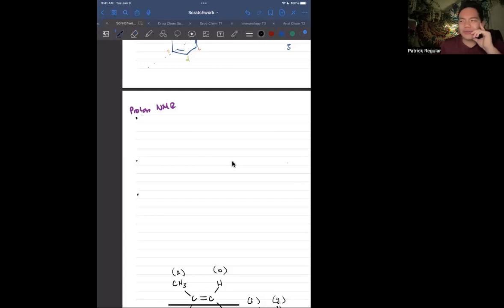I see a 3H that's a triplet, I see a terminal CH3. Or if you see a 9H single peak, it's going to be a tert-butyl group. And we'll talk about that later. But the integration is the first thing we talk about. Now the integration is the stuff you see where your peak is 9H or 3H. This is area under the curve.